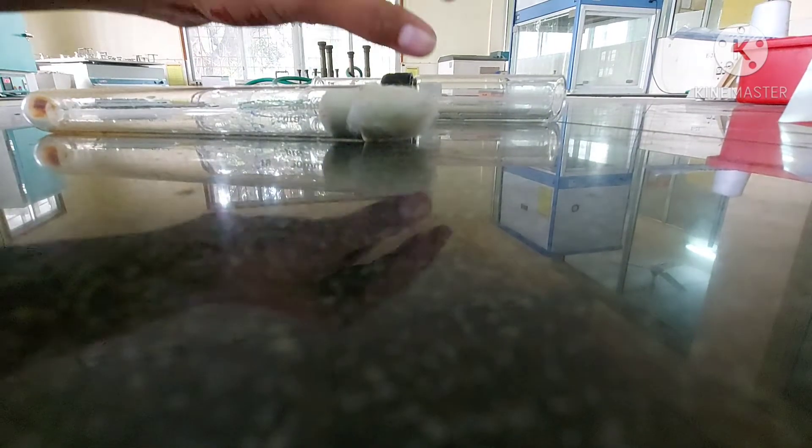The open end of these test tubes are sealed by using cotton plugs to avoid contamination and allow the passage of air.